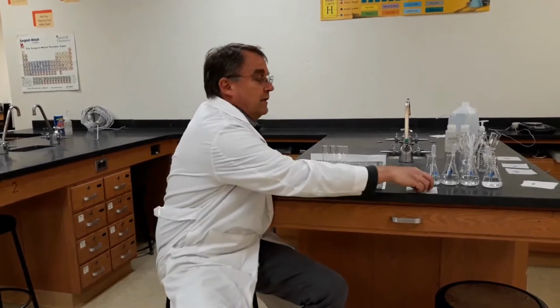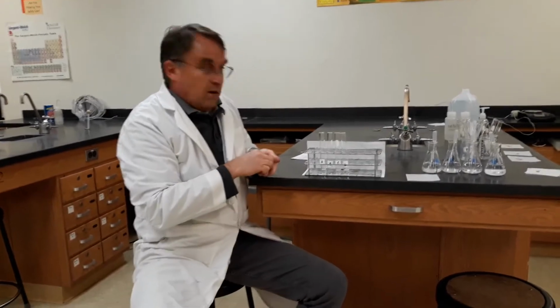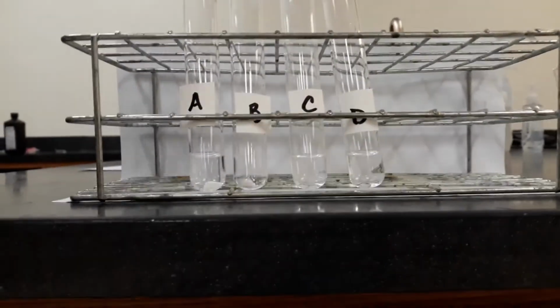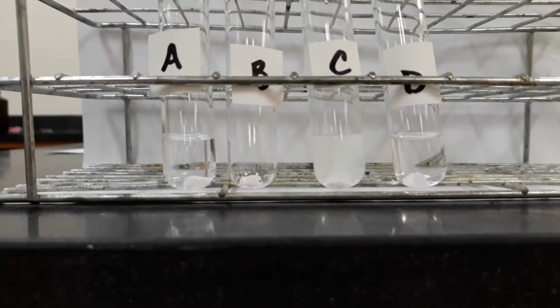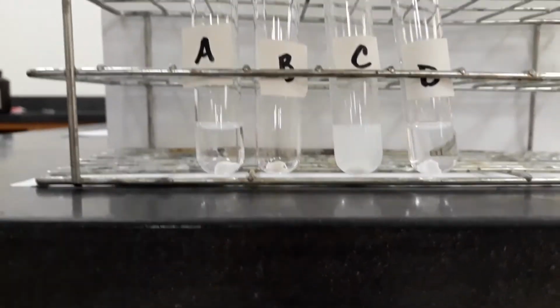All right, the next is part D, the effects on carbonates. And carbonates is just a type for any number of different minerals that react with acids or bases. I don't want to give away which it is, but you should know from the notes. Okay, so here we will see the four substances. Reaction with A, B, C, and D. And once again, I don't see anything in B. Lights are on, but nobody's home.